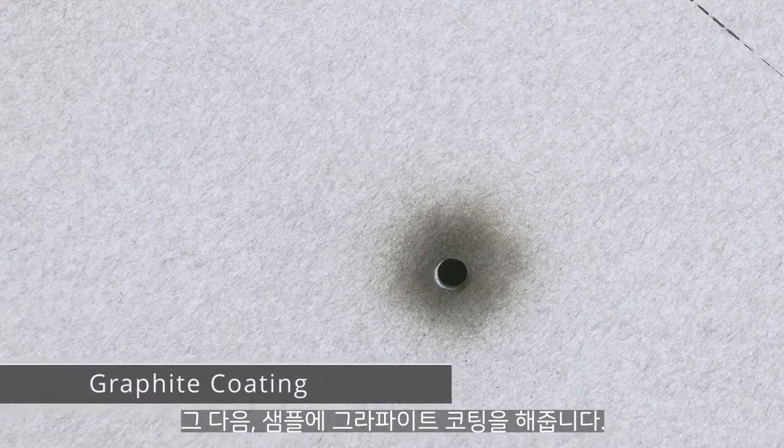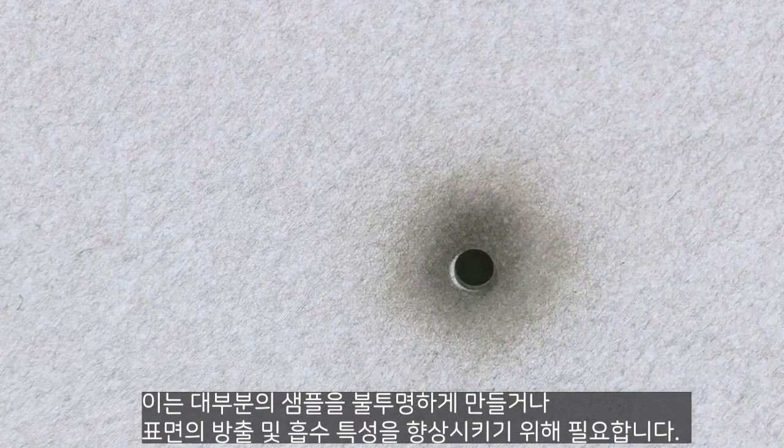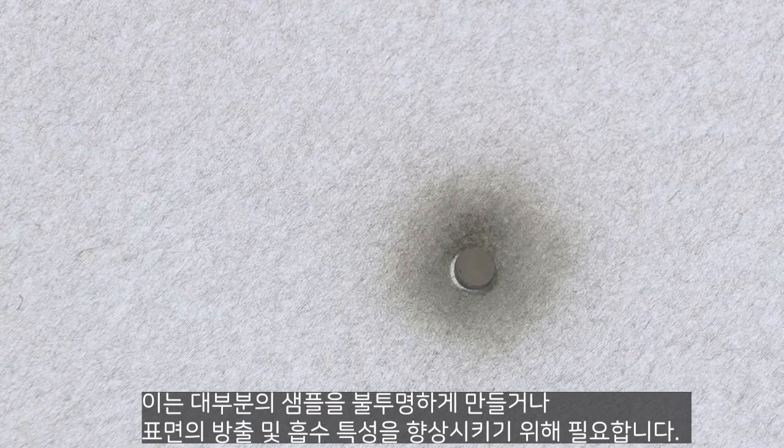Afterwards, a graphite coating is applied on the sample. This is necessary for most samples to make them opaque or to enhance the emission and absorption properties of the surfaces.